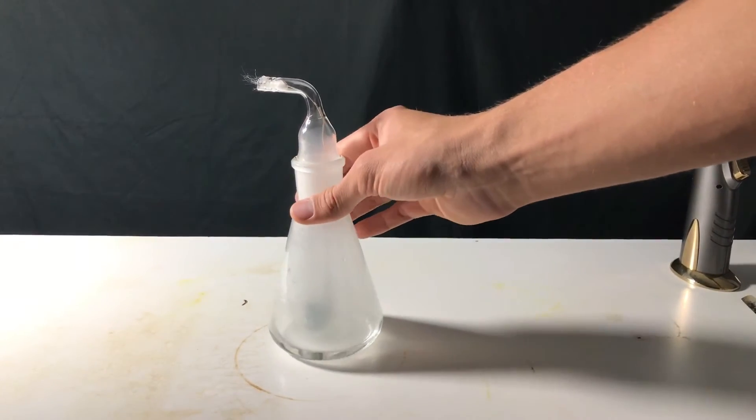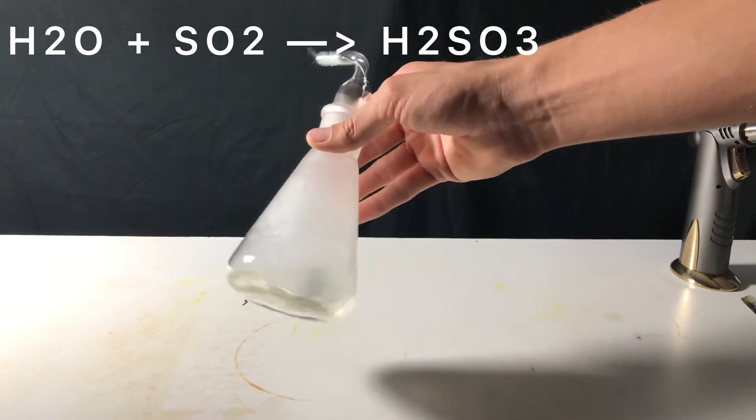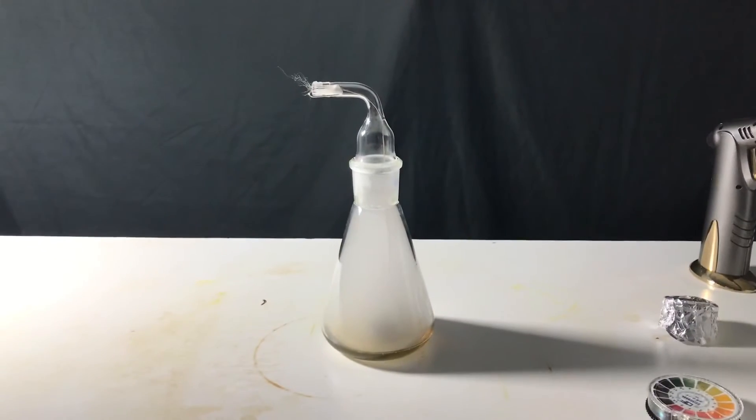After the sulfur stopped burning, the flask was swirled for a few times to dissolve the sulfur dioxide. Sulfurous acid is formed.